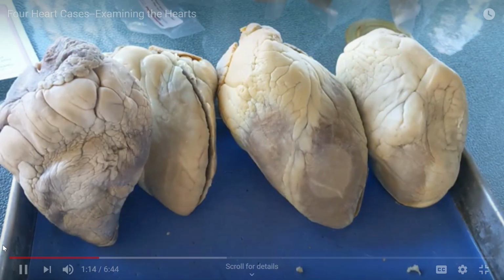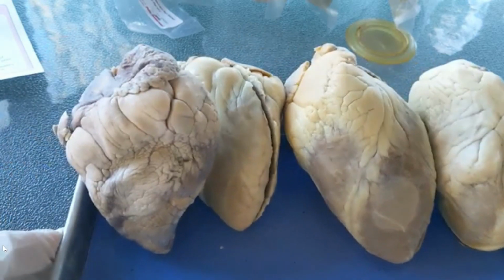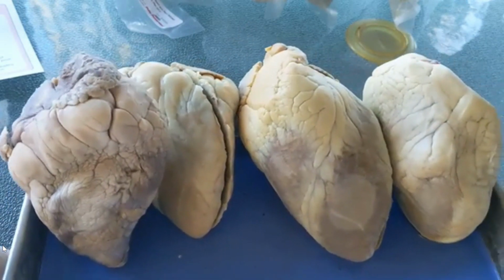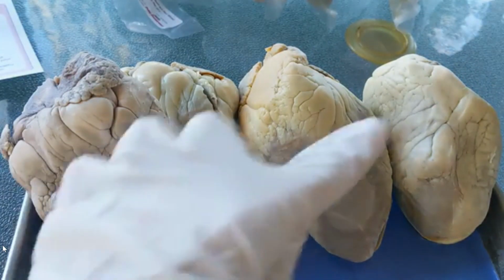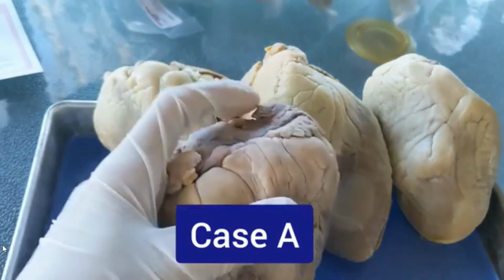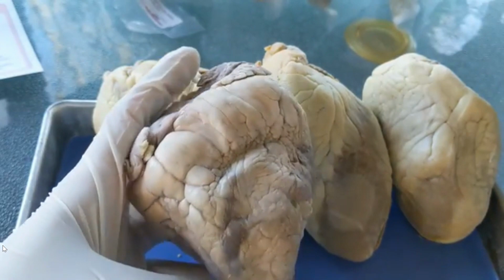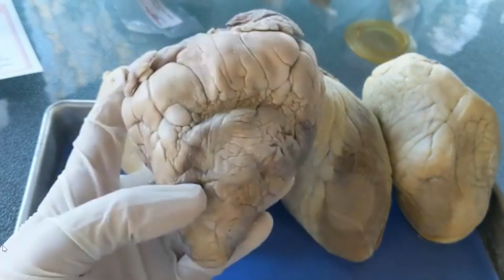After death, if the doctors suspect that the heart may have played a role, then they will do an autopsy and they'll look at the heart. So we have 4 hearts here, and I've lined them up from case A, B, C, and D. These are the hearts. So here is our 65-year-old overweight female. And first we're going to look at the front of the heart.